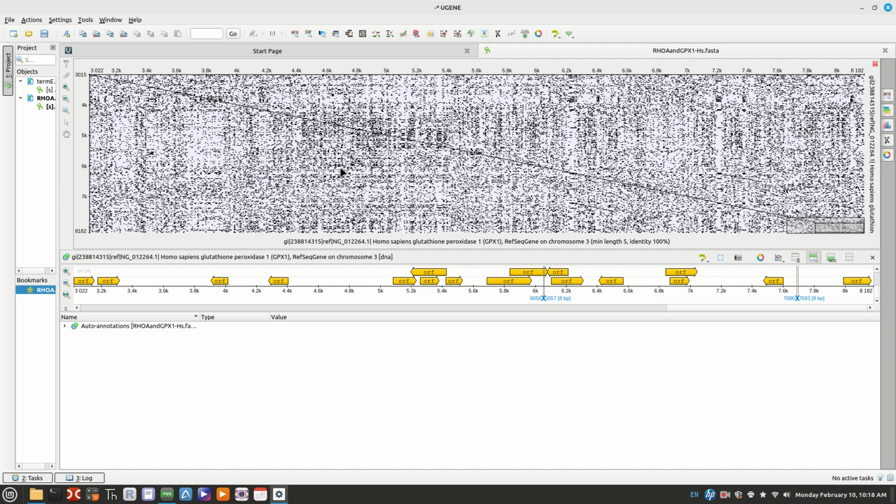But that's how to find the hairpin in the terminator. You kind of know the region it's going to be in. You know it's going to probably be around wherever our polyadenylation signal is. It needs to be after or incorporate the polyadenylation signal, because the polyadenylation signal needs to actually be on the sequence.